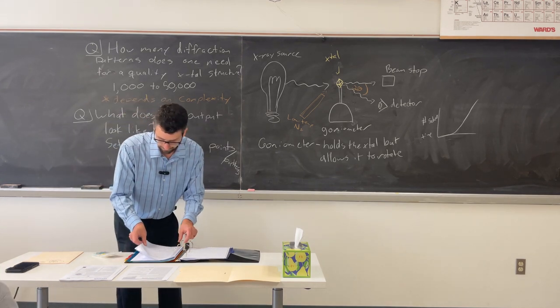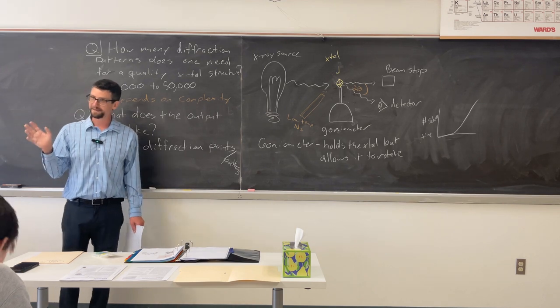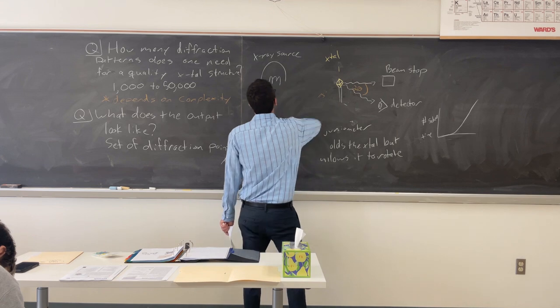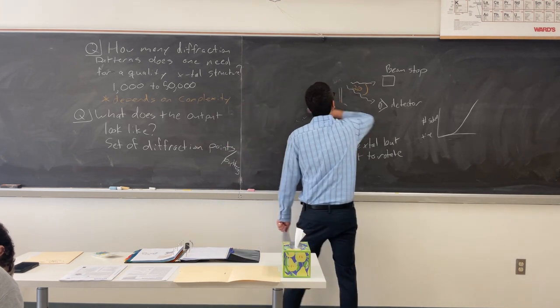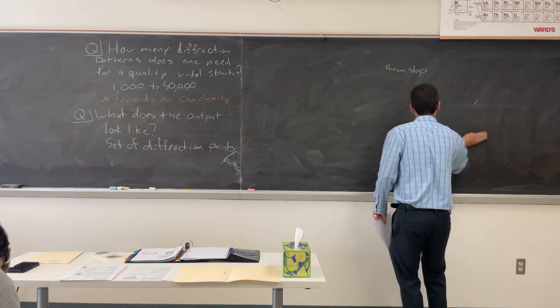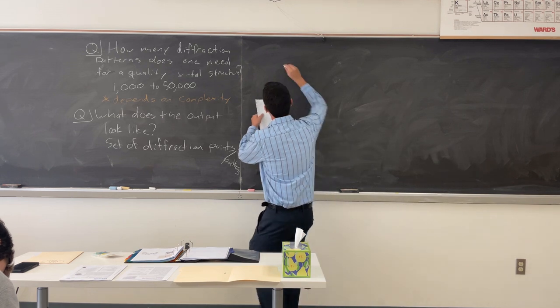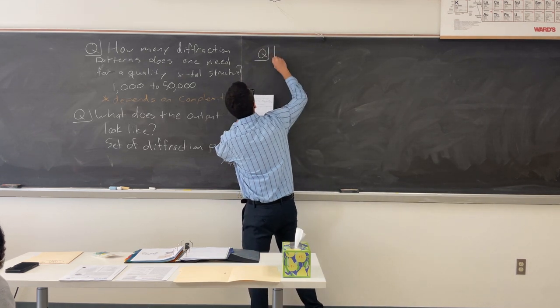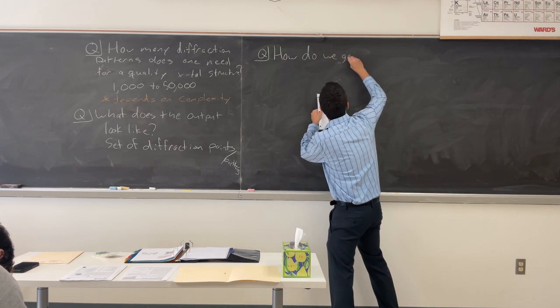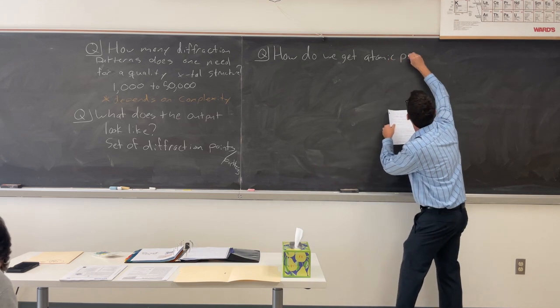But we have yet to explain how we actually get the atomic positions. So question: how do we get atomic positions?